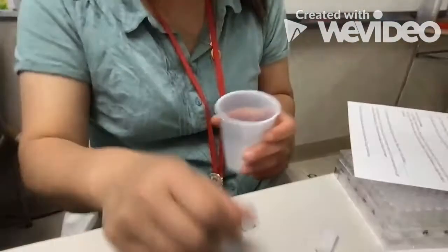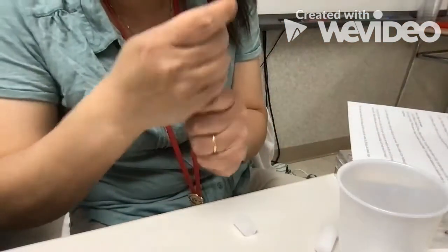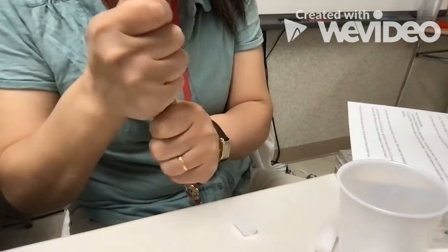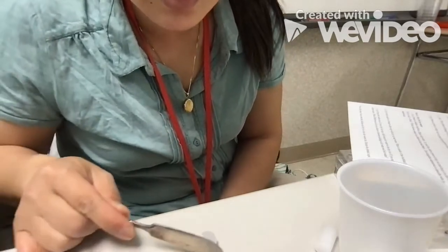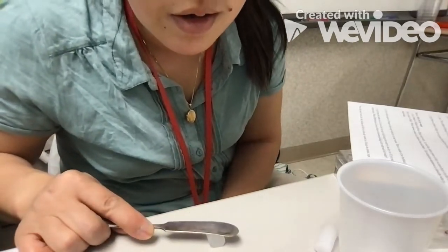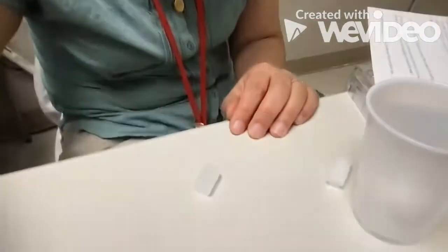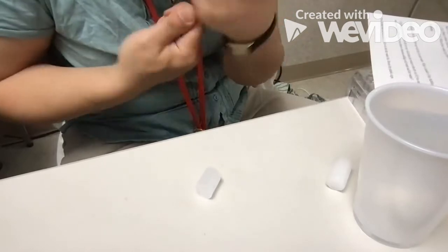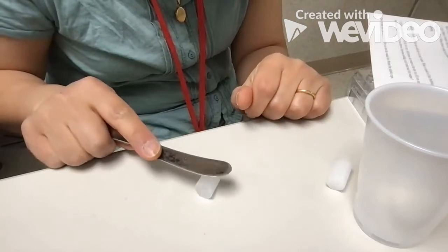Okay, and then you can answer the questions number 5, 6, and then for 7, I'll take a piece of dry ice and I will try to cut it with a utensil. Let me aim my camera down here so you can see it. So here's a piece of dry ice, and I can take my knife here. I'm going to warm it up a bit with my hands. Okay, and then I'm going to place this on here and see what you observe. It's screaming, does not want to be suppressed.